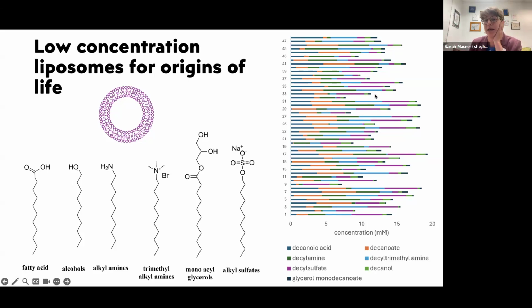So the end part of that comment is about principal component analysis. Could you explore how charge density versus nonpolar head group density impacts the PCA? And I think, yes, that's definitely something that could be done.